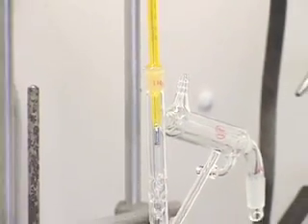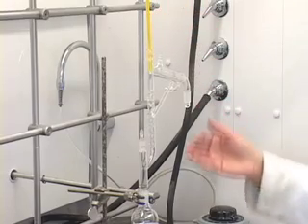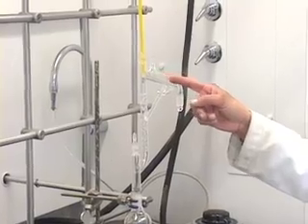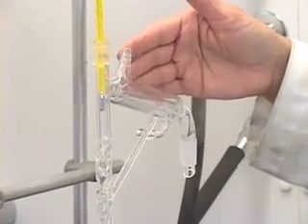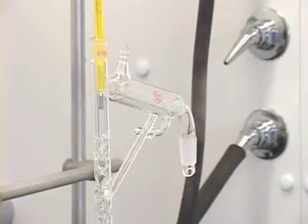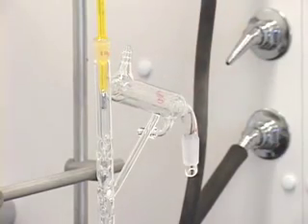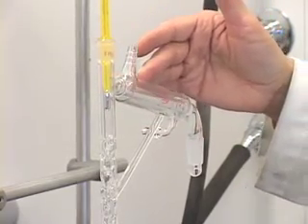We have the flask and the distillation setup. I have put in a stopper and the thermometer. When we heat the liquid, it vaporizes, and the vapors go through the Vigreux column and then through the condenser portion. This is where the vapors condense back into liquid form. We need some way of cooling the vapors in the condenser portion, which we do by circulating cold water through it.